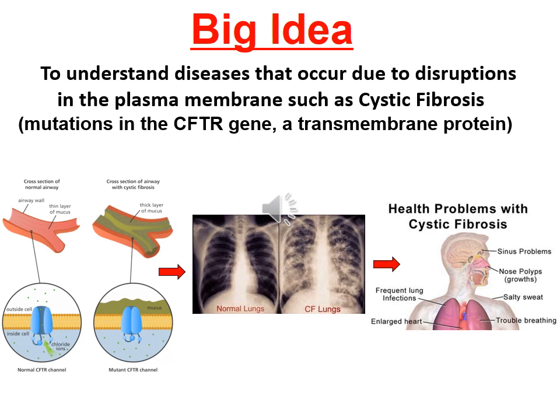etc. So you can see here that because of a change in the 3D structure of a transmembrane protein, in this case because of a mutation that is inherited from your parents, for example, this changes the 3D shape of the protein, and this leads to disease. That is why we're going over this experiment: a change in the 3D shape of a transmembrane protein, which is of course present on the plasma membrane, can lead to several diseases, and one of these diseases is cystic fibrosis.